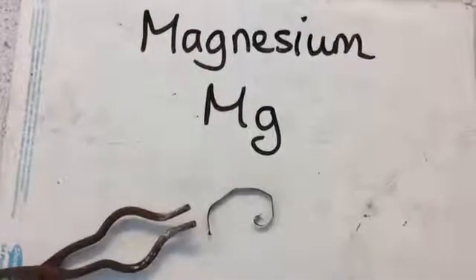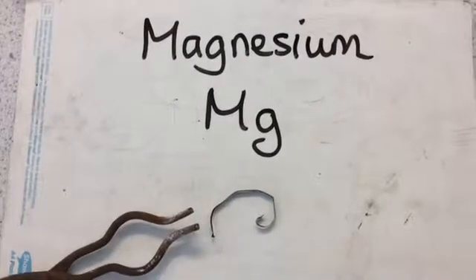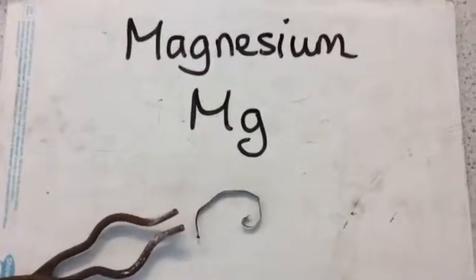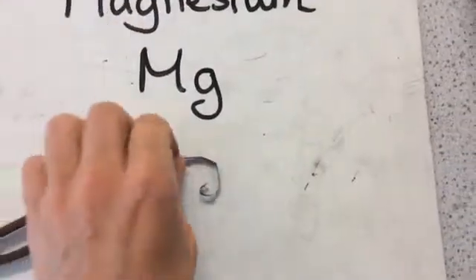So what we're going to be looking at is what type of oxide a metal will form when it burns with oxygen. So the metal we're going to use is magnesium, the symbol is Mg and here's a piece of magnesium.